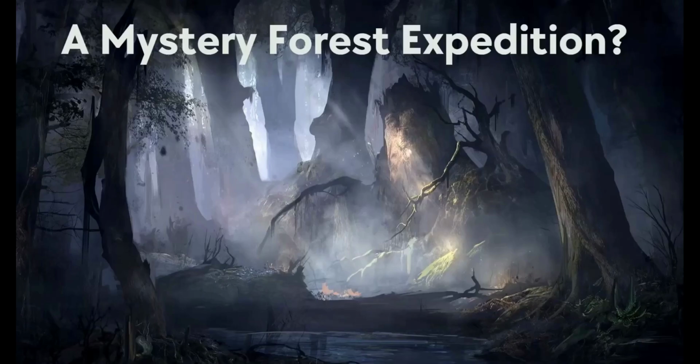But what exact species are found? What exact counts are there? You have no idea. That's exactly what it's like looking at raw metagenomic data. So today we'll embark on an expedition into this mysterious forest. Not with scanners, not with maps, not with guidebooks, but with our powerful tools. We can use Kraken 2, MetaPhlAn, and Krona, and then we'll be able to uncover the hidden species in our sample through using these powerful tools.